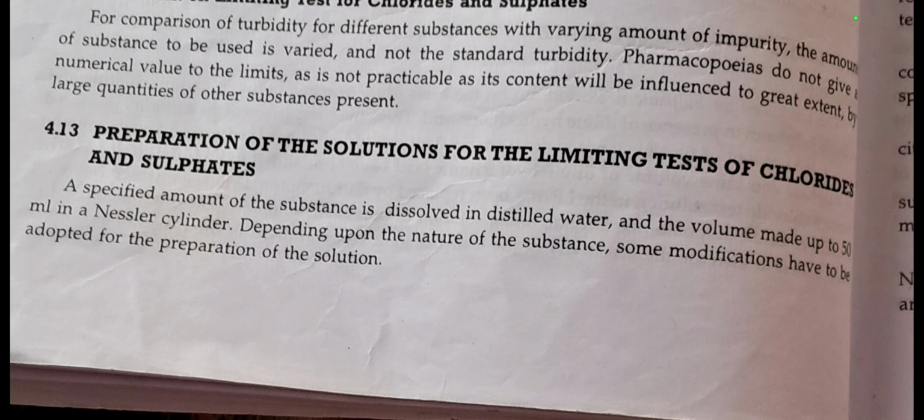A specified amount of the substance is dissolved in distilled water and the volume made up to 50 ml in a Nessler cylinder. Depending upon the nature of the given unknown substance, whether it is an alkaline substance, insoluble in nature, a salt of an organic acid, a deeply colored substance, or an oxidizing or reducing substance, we have to do some modification.